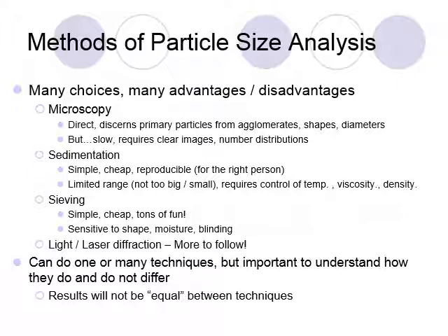We'll talk more about this, but I'm really going to focus on these 4 areas of measurement here. I'll be very brief on the microscopy, sedimentation, and sieving. I'm going to talk a lot more about laser diffraction because that's what I do. But understanding the different techniques that people use and being able to go between them is important.